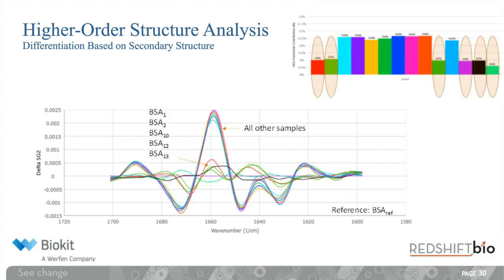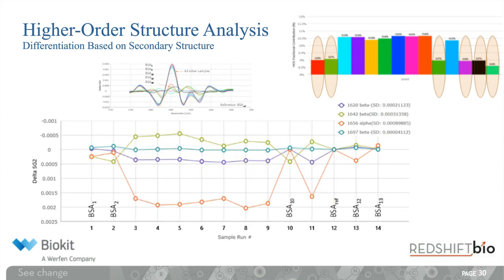As this study showed, it is clear that structural differences exist among these BSA samples, and the delta of second derivatives accentuates these structural differences, which in our case are very small, like I said before, smaller than 2%. And it is clear that some BSA samples are more similar than others. Similarity plots show that the OK BSA sample differences were smaller than those observed for the rest of the samples. That is why understanding and managing structural differences is essential for product quality.